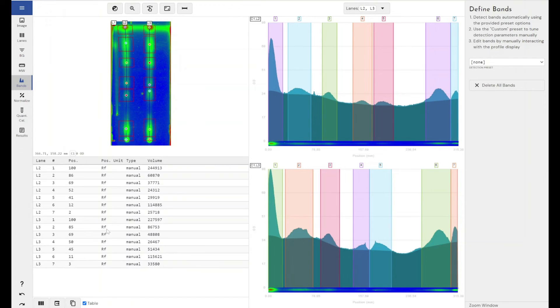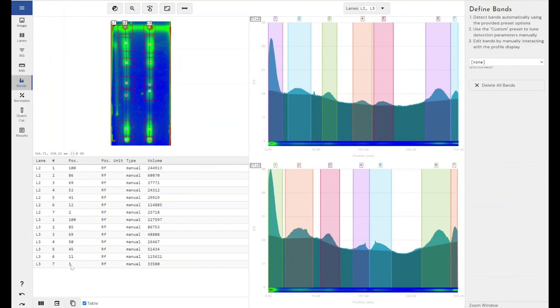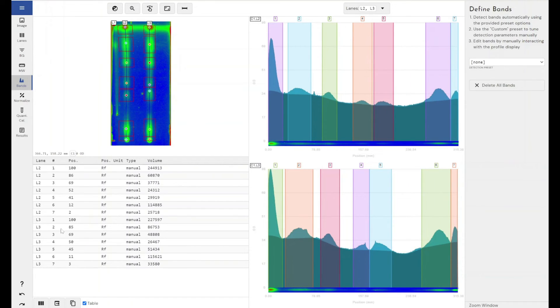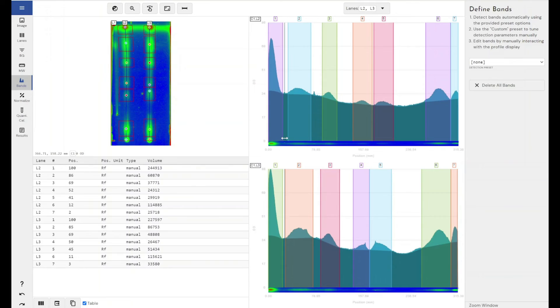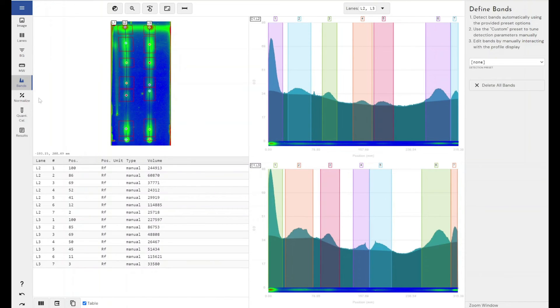So I've got all of my sections here. So what I can do is I've got lane two band seven. That's moved slightly further down the plate than it has here. But again, it's very close. So this is how you would get your RF values out from your experiment. And you can also get the volume. So this is the volume of the peak. So the volume of the peak will be relative to the amount of substance within the fraction that you're separating using your chromatography technique.